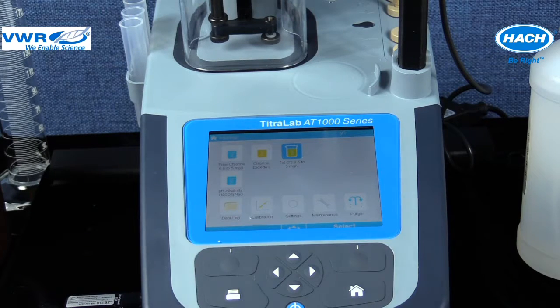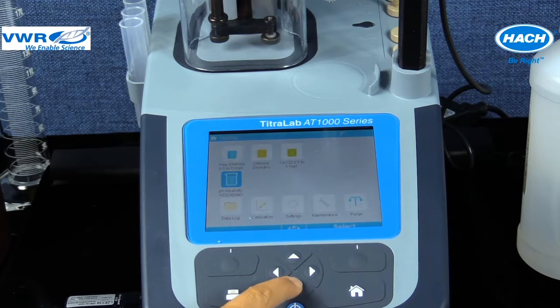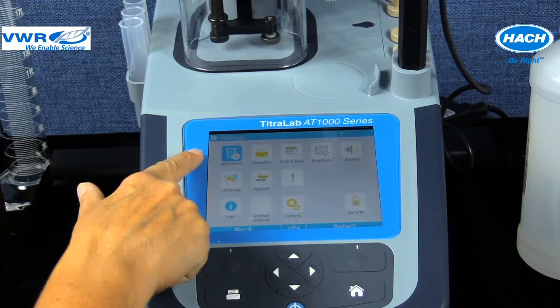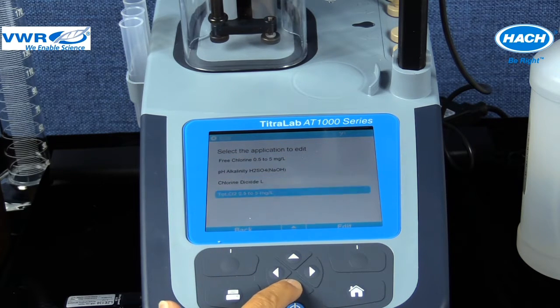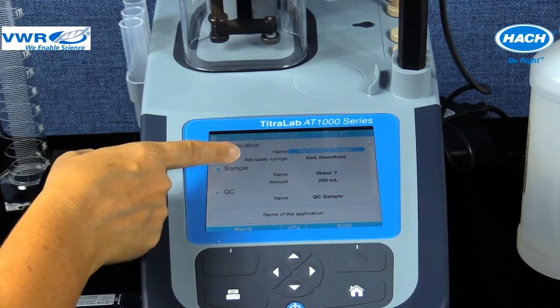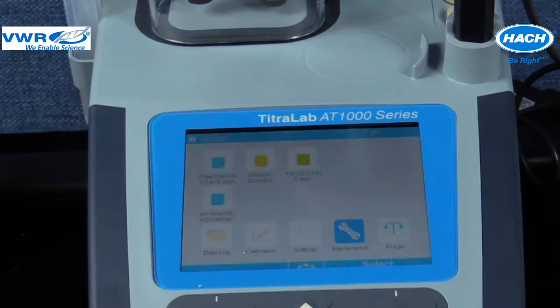In this training, a 5 ml syringe is installed. Detailed in the application notes located under the settings menu and loading the total chlorine method, the syringe information is at the top of the applications page. Syringe setting in the Titrator software uses a 10 ml syringe volume as the default. The syringe size can be changed in the software from the home menu by performing the following steps.